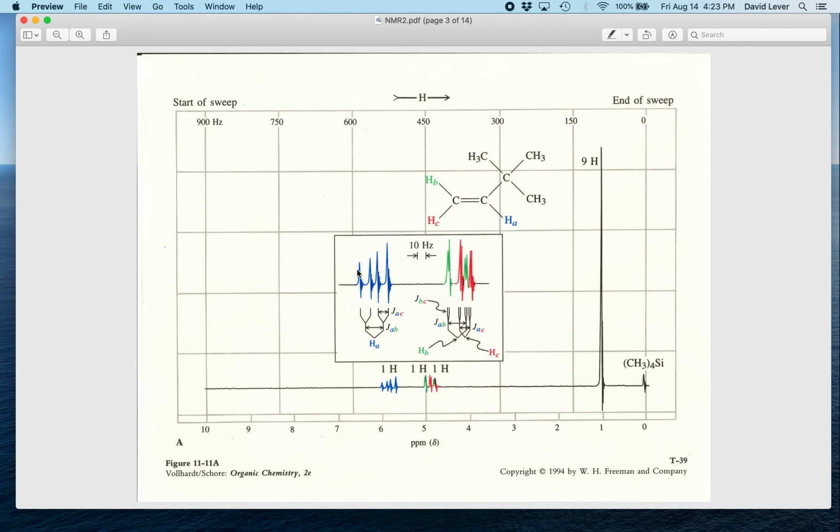It's actually identical to the difference between the 1 and 2 peaks here, because that's the AB coupling, and the AC coupling is the same in both cases. And then the same geminal coupling, which is very small, so we see the same difference between these two peaks and between these two peaks. So that's a typical ABX pattern. It's a little messy here. This is recorded at 90 megahertz because the chemical shift difference is so small relative to the coupling constants.